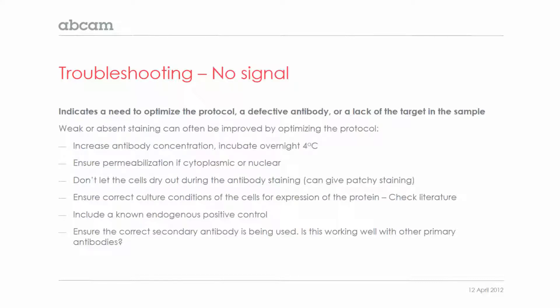If you have no signal, this indicates a need to optimise the protocol. You might have a defective antibody, or there may be a lack of target in the sample, and you could check that with a literature search to see how much target should be there. We would recommend increasing the antibody concentration and making sure you incubate overnight at four degrees. Increasing that concentration should mean that you increase the amount of staining.